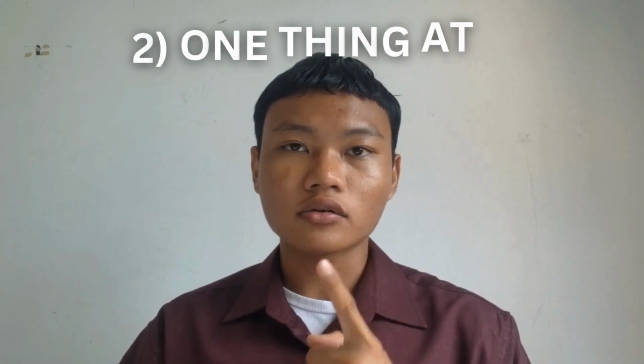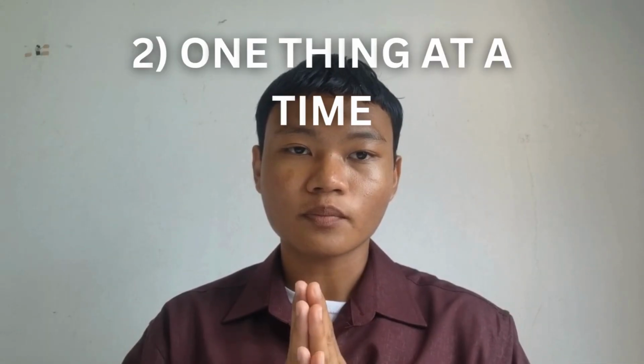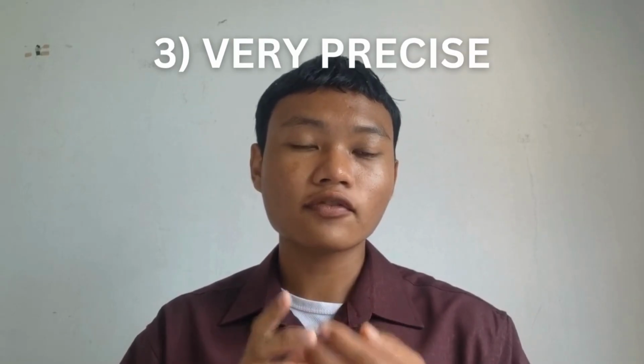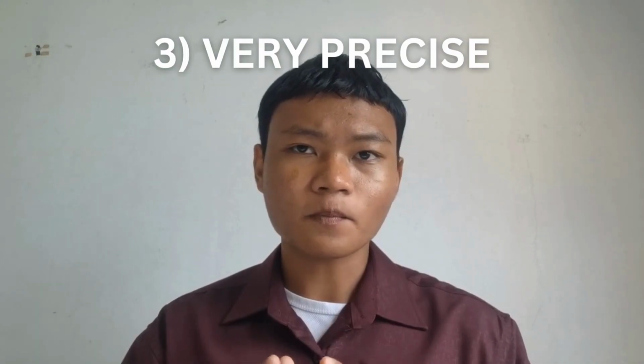Gravimetric analysis usually only targets one element or compound at a time. So, if you are dealing with a complex mixture with multiple components, you need to run separate analyses for each one. There's a lot of glassware and patience. Number 3, it demands precise, careful lab technique. Any contamination or incomplete precipitation or maybe error in weighing can completely ruin the result. One tiny mistake and all your hard work is wasted.